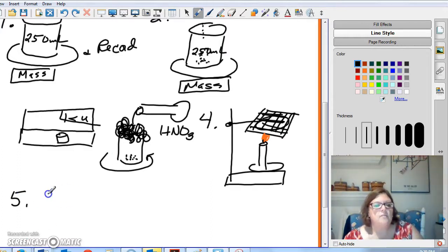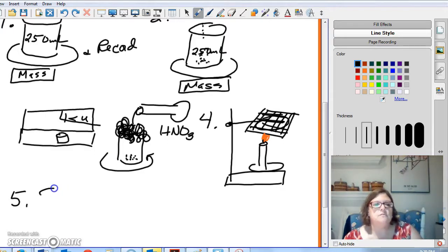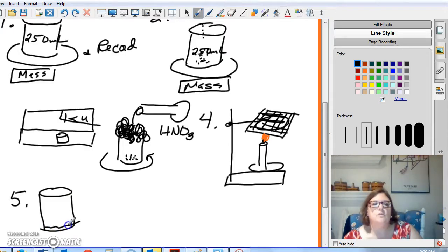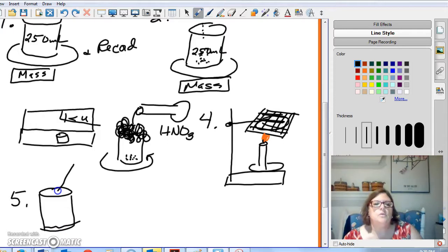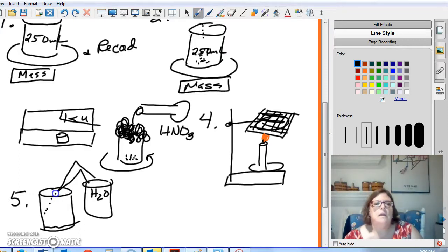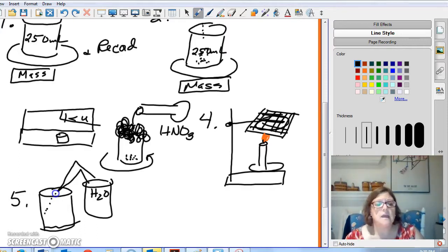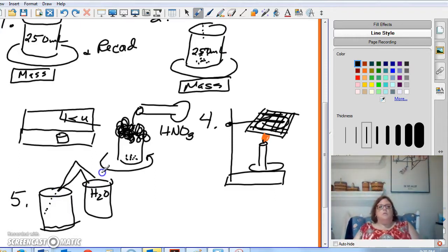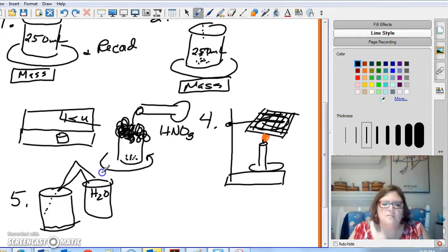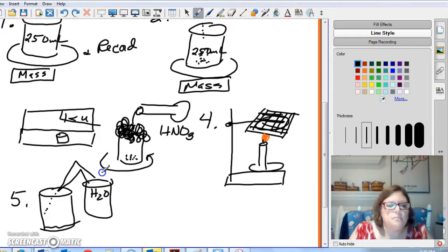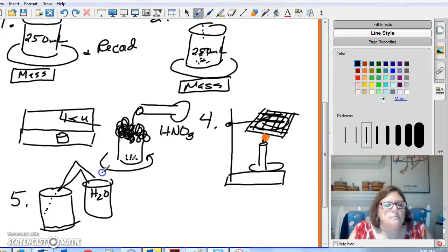Step five, you're going to add about 100 milliliters of distilled water. So, here is your beaker. And you've got a little bit of liquid in there with your solid. And you're going to add 100 milliliters of distilled water. And you're going to use one of your wash bottles. And it's approximately 100. It doesn't have to be exact. Add what you can or add up to about the 100 line. If it's 120, that's okay. If it's 95, that's okay. Don't panic.